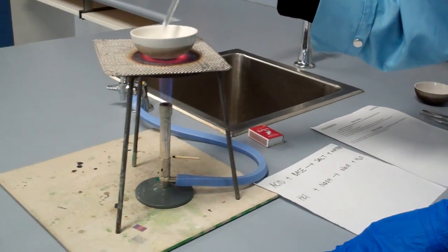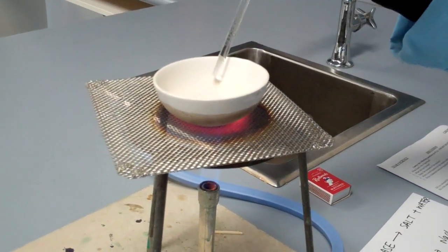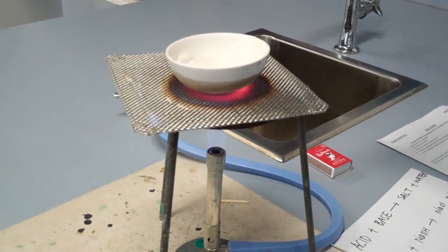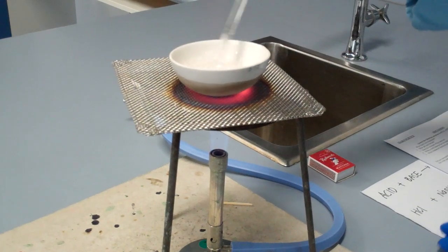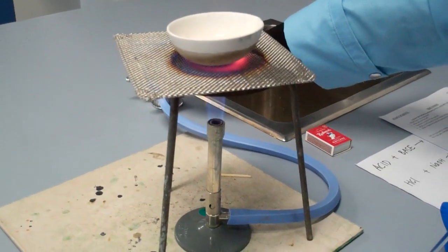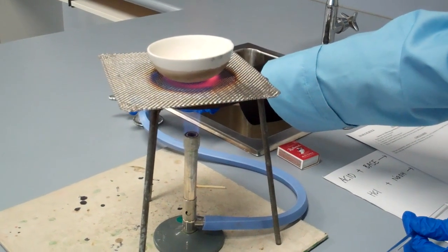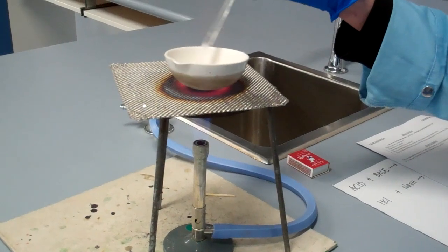So now I need to stir the solution. You can see that quite a bit of the liquid has been evaporated, but we still need to evaporate all of the liquid from the evaporating dish so that we can get the salt that was formed from the acid and base reaction. Now we need to turn the Bunsen burner a little bit lower, so just adjust it so that the flame is not that strong. I'll just adjust the gas. Alright, I'll continue to stir until all the liquid is evaporated.